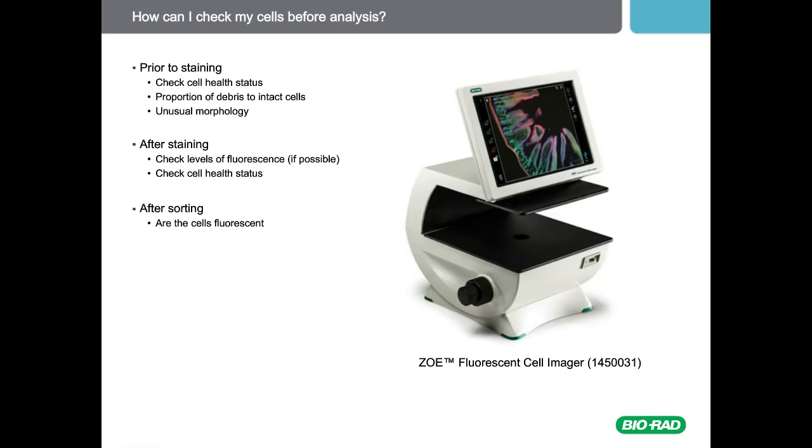Finally, after sorting, it is advisable to check your cells' health, if you're culturing them, and fluorescence levels to ensure you have the right population to proceed with other experiments.